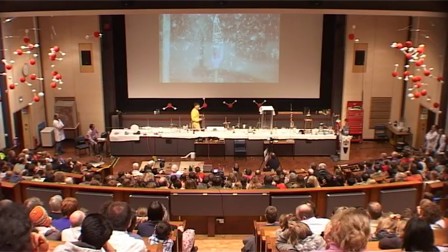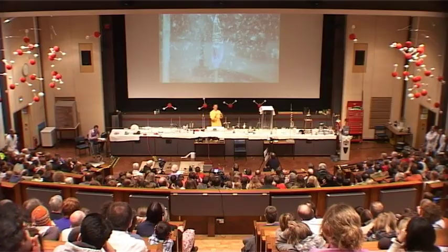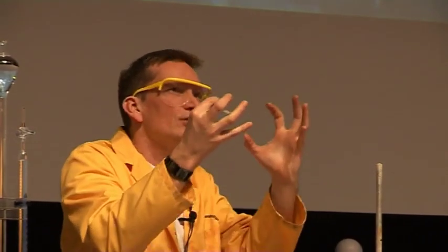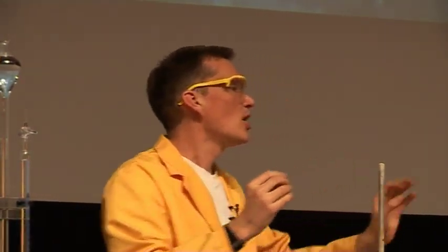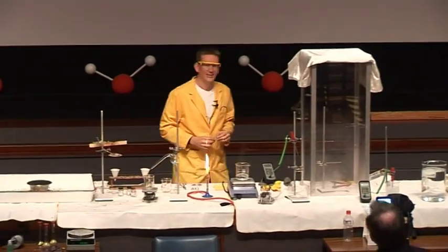Now, what's going to happen over here? We have our water being heated up, turning into steam, but there's nowhere for the steam to go. This means the pressure inside this glass vessel is building up, building up, building up, nowhere for it to escape. Now, what's going to happen? Something's got to give. And what's going to give is the glass container. So watch very carefully. You can see the glass tube there now, and it's heating up. The water is turning into steam, which should take up much more space, but it's now gone.